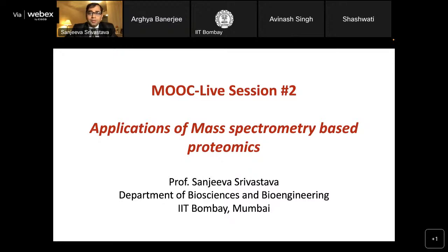Today we are going to focus on one specific proteomic technology, mass spectrometry, which I'm sure by now you have recognized is a very important technique and tool which has given power to the proteomic scientist. And now we are able to investigate the proteome and proteome-scale problems at a very unprecedented level, which was not possible earlier. Therefore, today's session is going to be more thematic, looking at mass spectrometry-based proteomics.